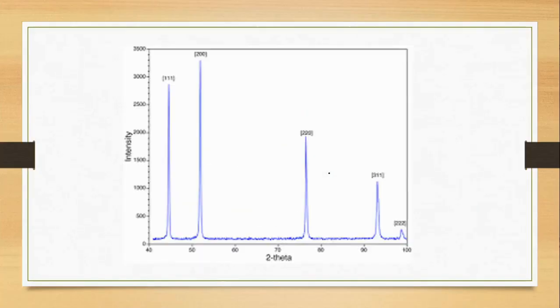And what you see on top is referred to as the Miller indices. Okay, sorry, I keep getting interrupted. So this top part is referred to as the Miller indices, and you can see these peaks. These peaks indicate there's a crystal structure. This bottom part is just purely noise, so you can just neglect this. I hope you have an idea now of what it is.